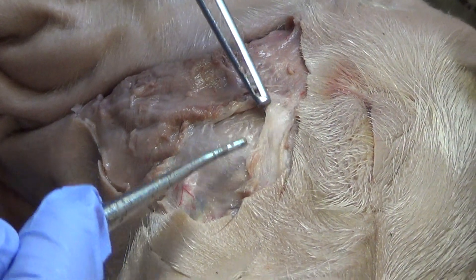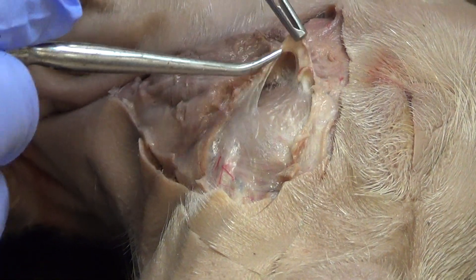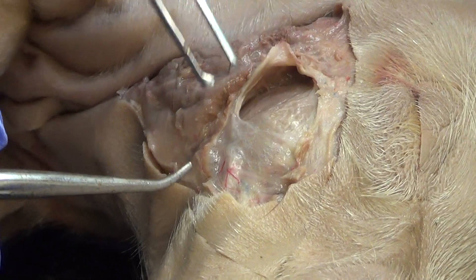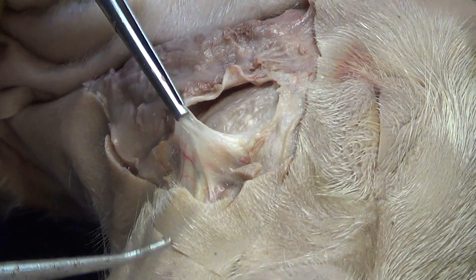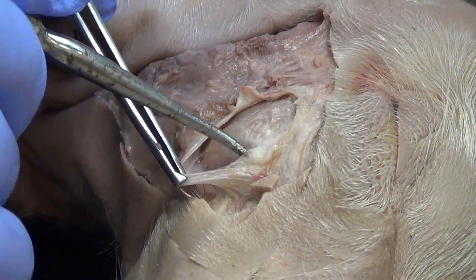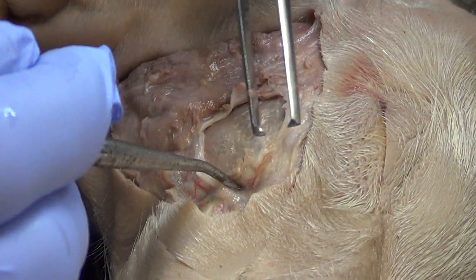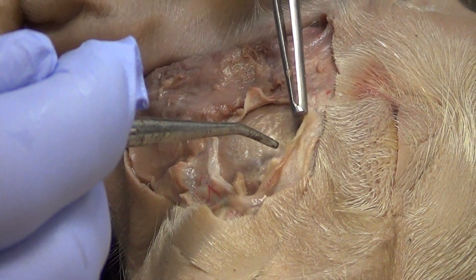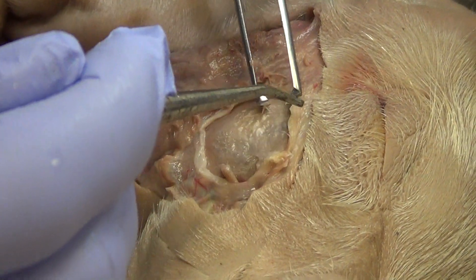Now you can see the masseter pretty well. Start using the probe — anything that's a clearish, whitish substance is connective tissue. There is a big flap of connective tissue; just work underneath that without destroying the masseter. Unfortunately, some of you will destroy the masseter. You'll know if you get little strings starting to appear — then you know you've gone too deep.